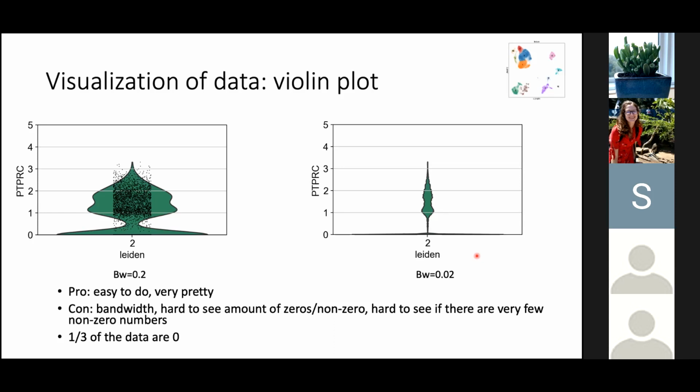As a matter of fact, I think that gap is real. It's very possible that it's somehow sampling bias, but I think it probably comes down to the biology, like transcriptional activation. Either the gene expression program is on or it's off in the cell. If it's on, it's expressed at a specific level, not just any level. There is some stochasticity, but it is either on or off at the regulatory level.